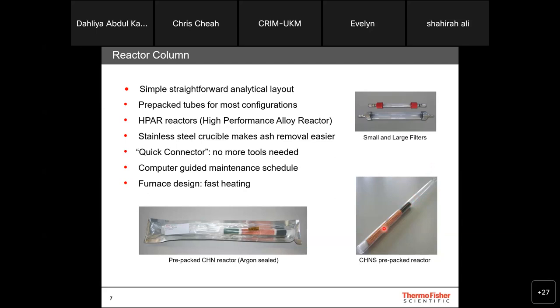After conversion, moisture will always be created. In terms of chemistry, whenever a gas is being created, there's always a byproduct, and moisture or water will be the byproduct. So we need to filter off the moisture through some magnesium anhydrone. This removes the moisture content because we need to protect our analytical column. Otherwise, your column will be saturated with moisture and the separation will be reduced.